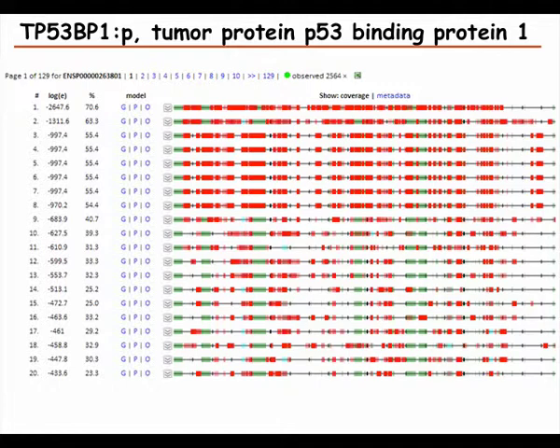Now there are constantly new data sets that people put out, and usually there are very few new proteins being observed. It's only when people look at some very specific cells that new proteins show up. But in general, when people do a random proteomics experiment, there are no new proteins observed.